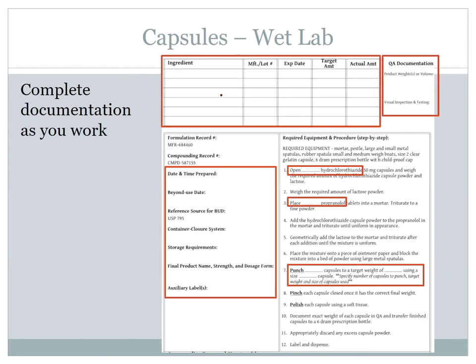As far as making it goes, I will tell you, your propranolol tablets are yellow. The hydrochlorothiazide is a bright yellow, so your active ingredients are a nice yellow color. Therefore, you do not need to add the food coloring. I have food coloring out there because next week you might need to add food coloring. How will you know? If your active ingredients are white and the lactose is white, you add food coloring. In this case, your active ingredients are yellow and your lactose is white, so you don't need any external food coloring. So in that case, you don't need to worry about that, okay?